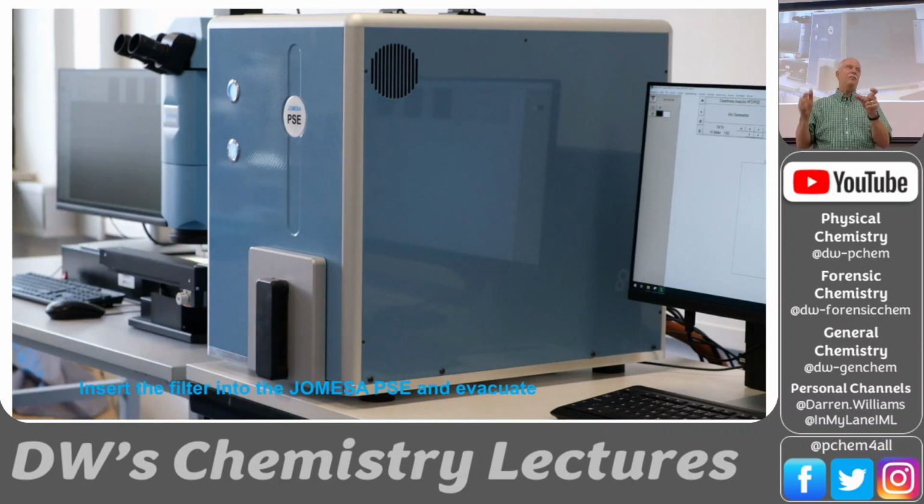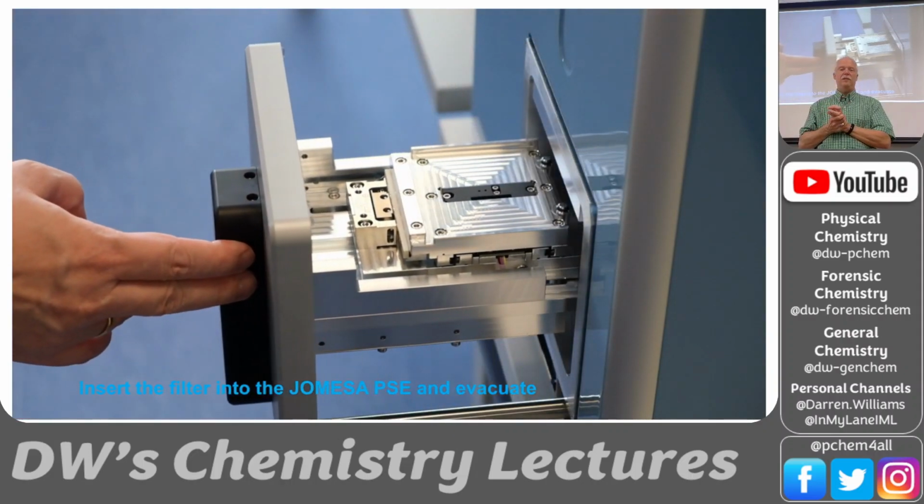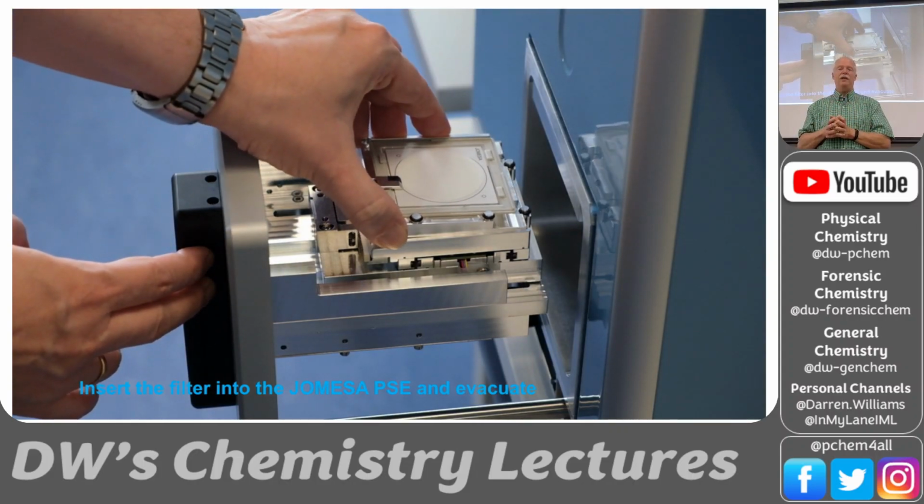So it can go to that particle and do a scanning electron micrograph to get a better picture of the shape, the size, but more importantly, it can give you the composition.